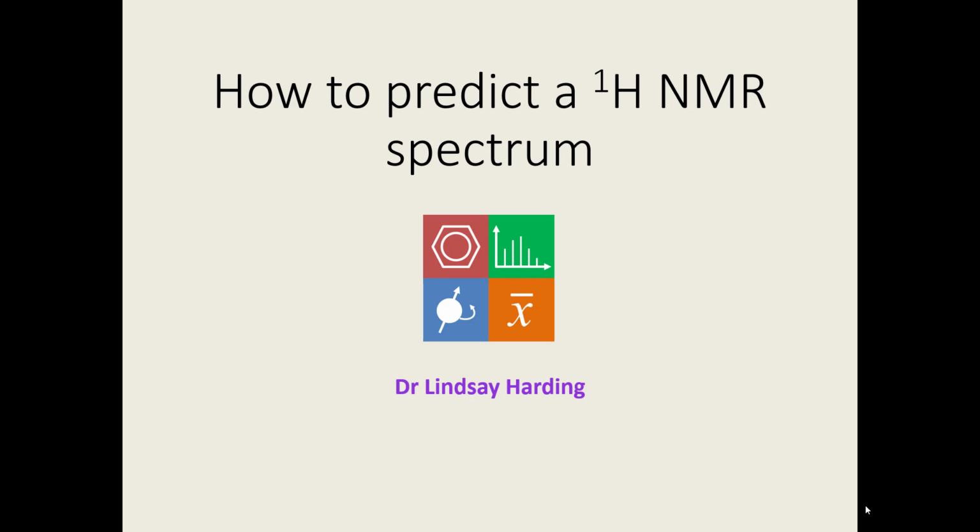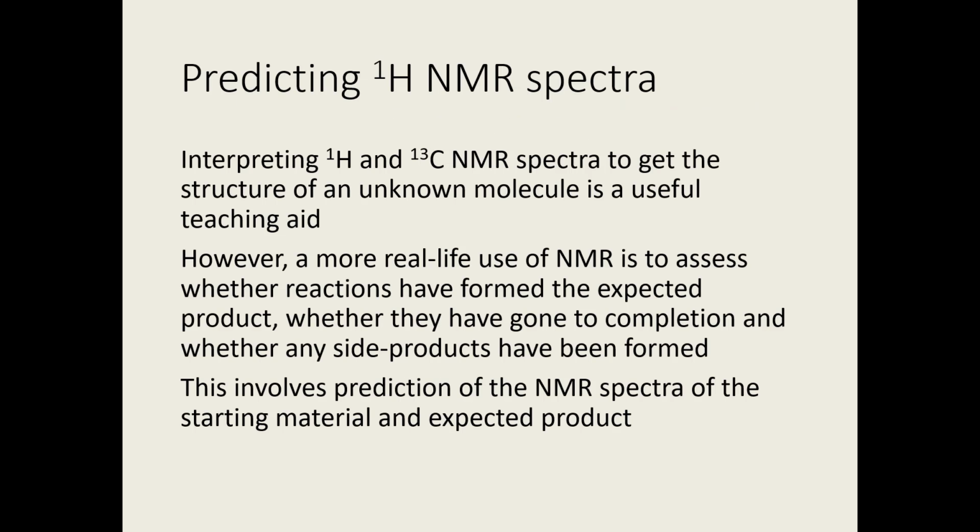Hello and welcome to this video on how to predict what the proton NMR spectrum of a compound will look like and why that might be useful. The way that we teach NMR interpretation, by interpreting the proton and carbon spectra to get the structure of a completely unknown molecule, isn't a real-life application of the technique.